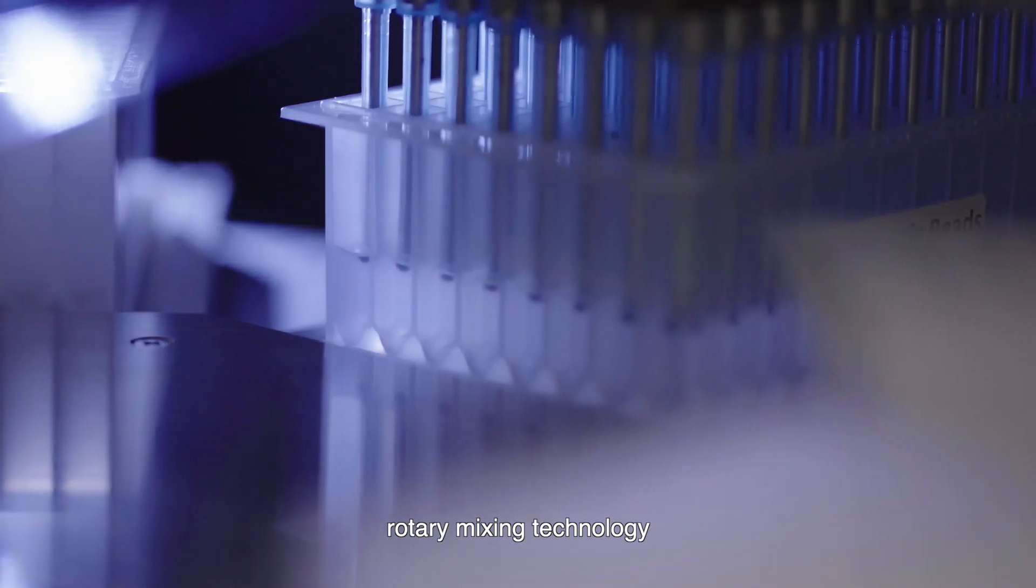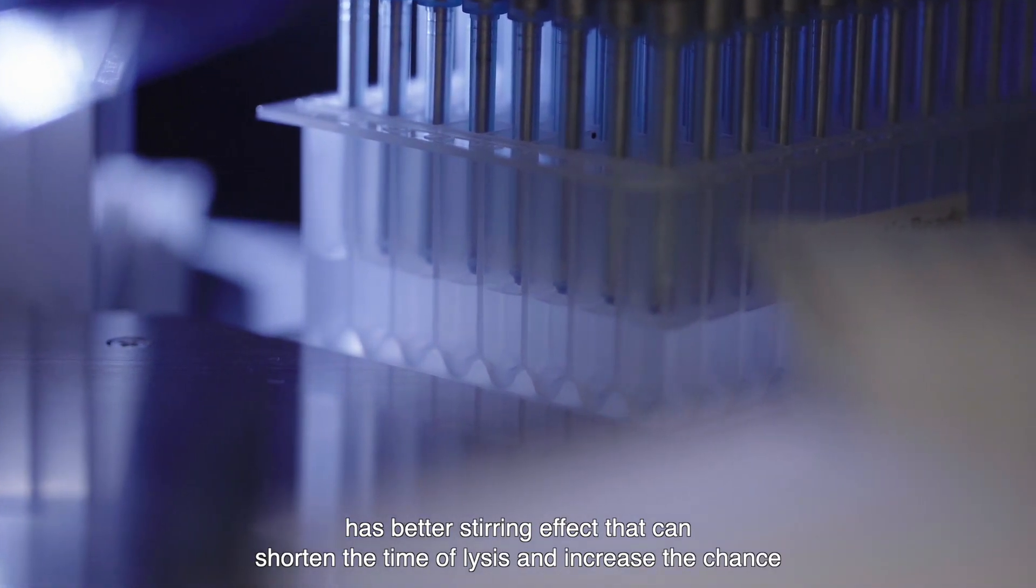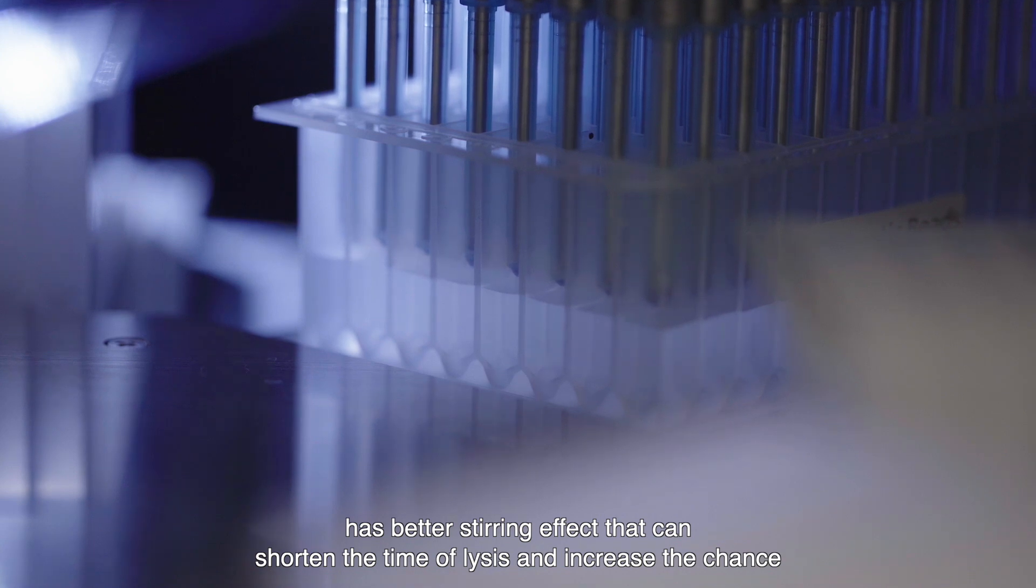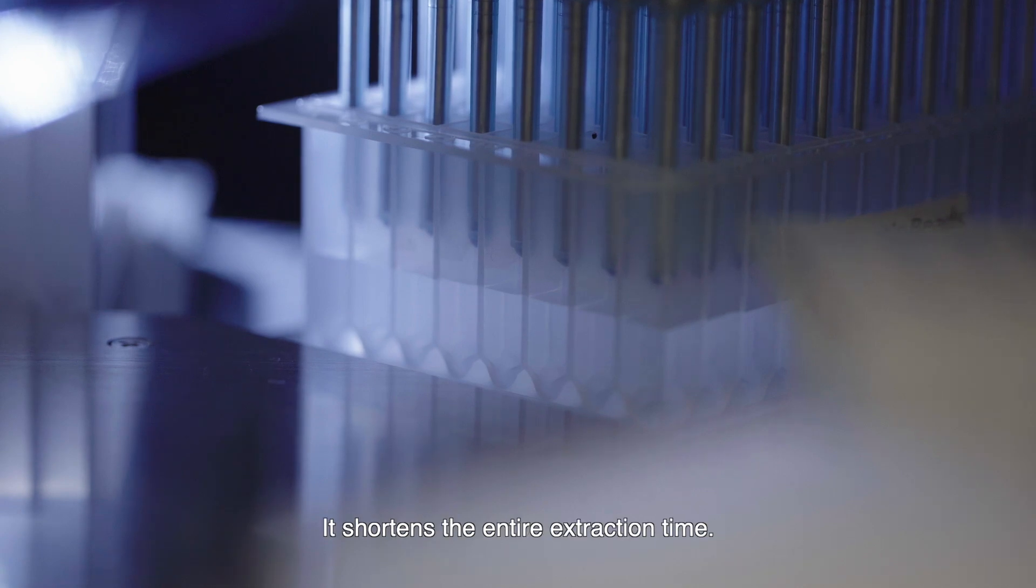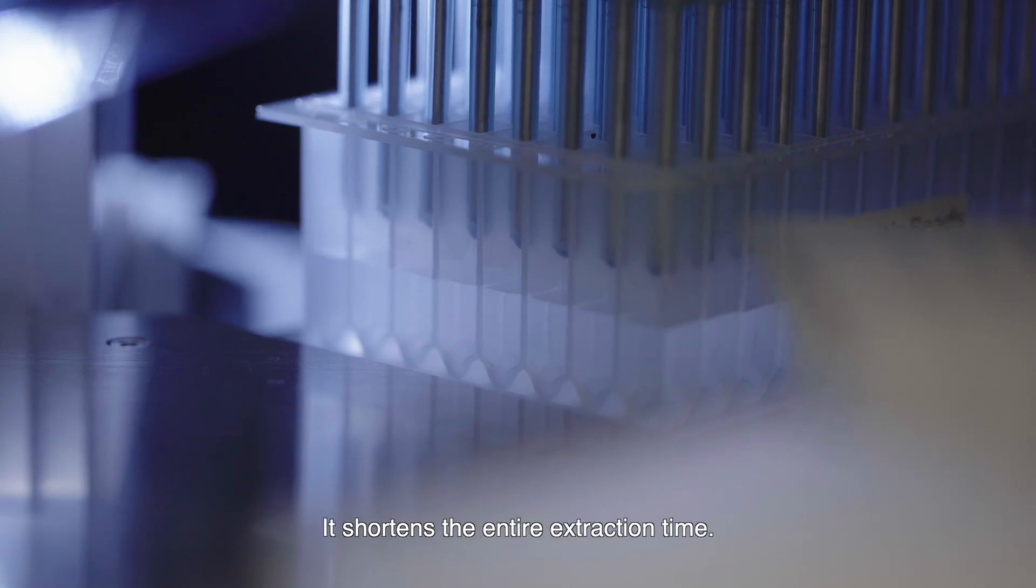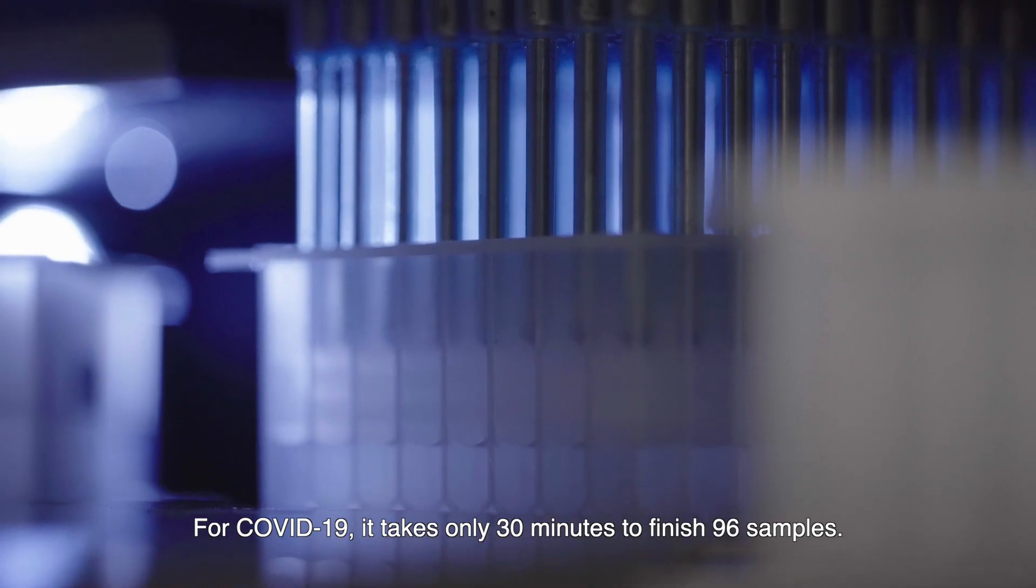Shorter extraction time. Rotary mixing technology has better stirring effect that can shorten the time of lysis and increase the chance of magnetic beads to contact and absorb nucleic acid. This shortens the entire extraction time. For COVID-19, it takes only 30 minutes to finish 96 samples.